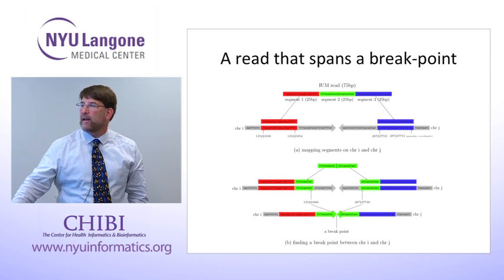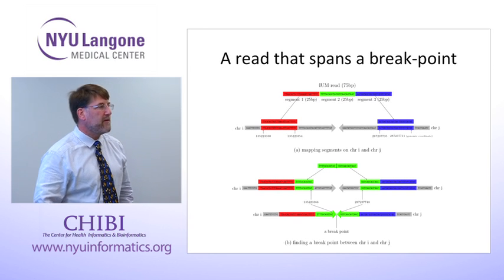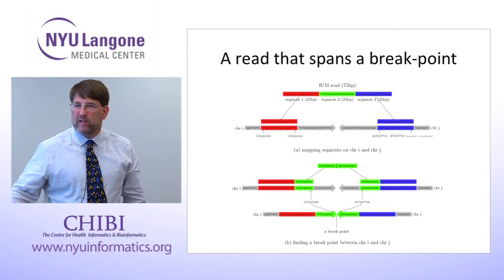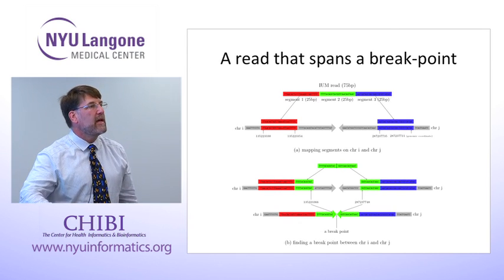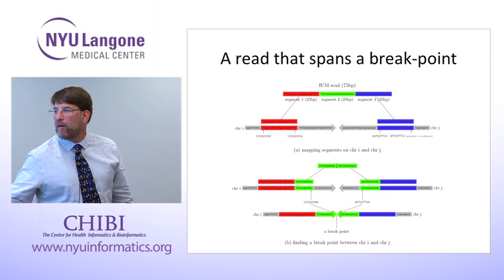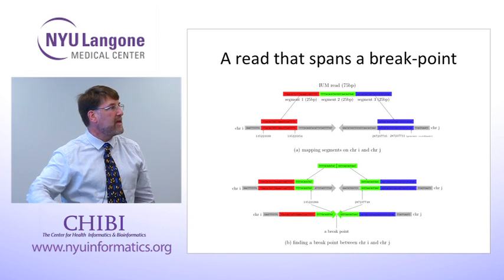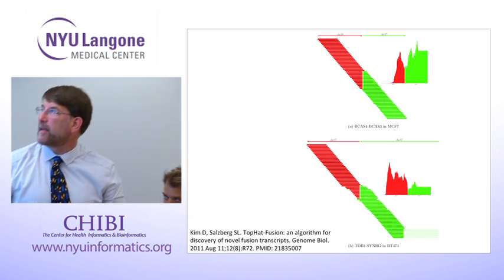And so when you create a putative junction fragment, you can do an alignment of your read across that junction fragment. Now that you have a junction fragment, you can go back to your library of sequence reads and see if any other reads map to this junction fragment, even though maybe they're not long enough to give you 25 bases that land on the other side. The result looks like this.